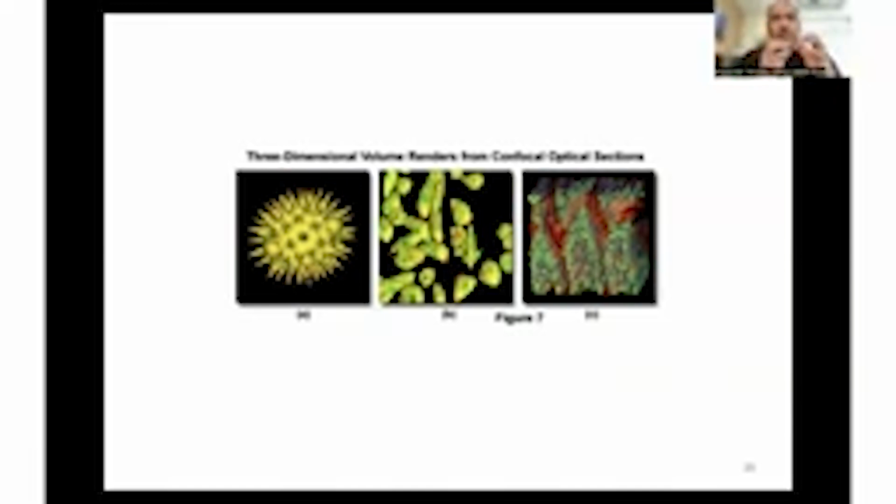This, in my opinion, was a real game changer in microscopy. Okay, and along with the kind of change in visualization that those early microscopes produced, confocal changed how we view things.